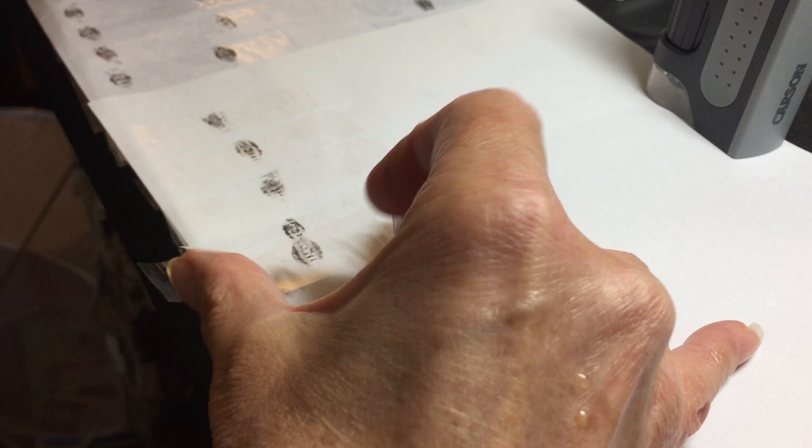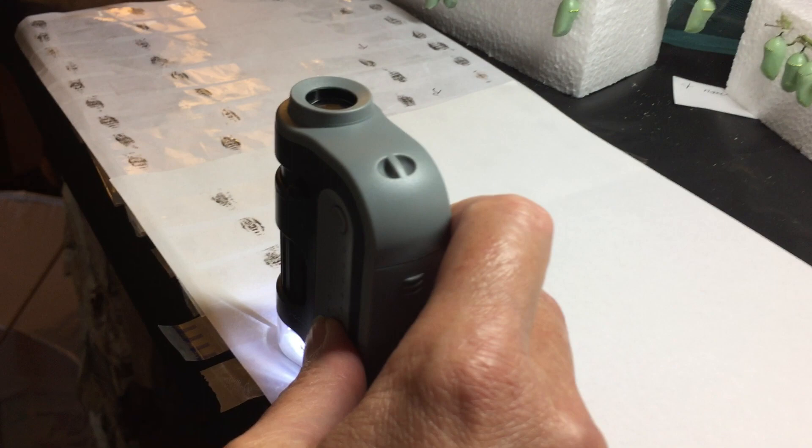I put that on white paper and turn my little twelve dollar LED microscope on, and take a peek.